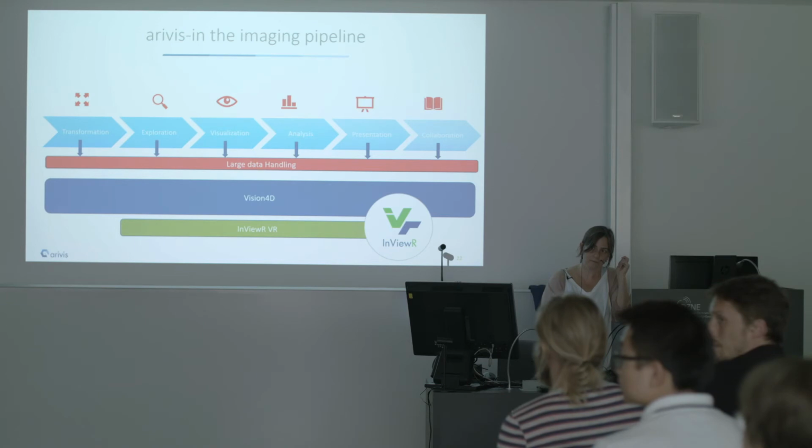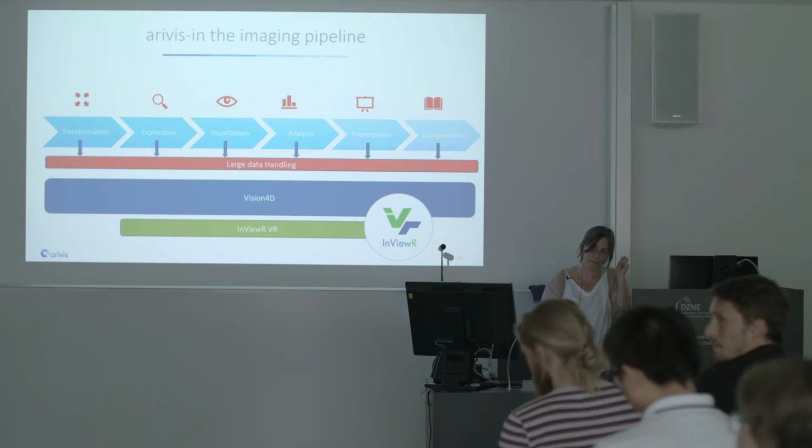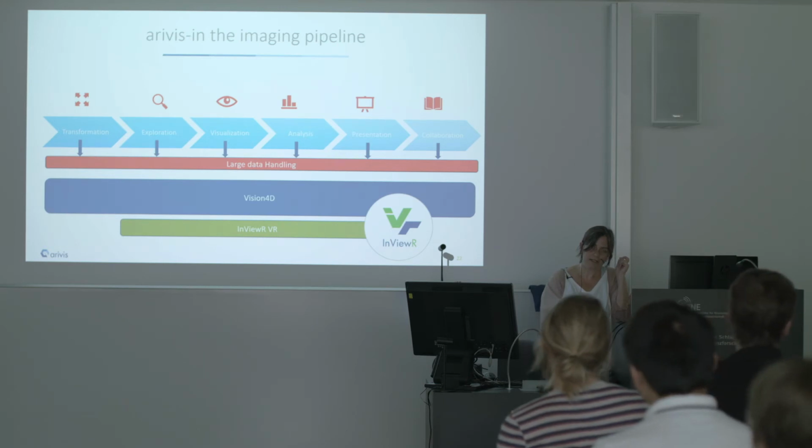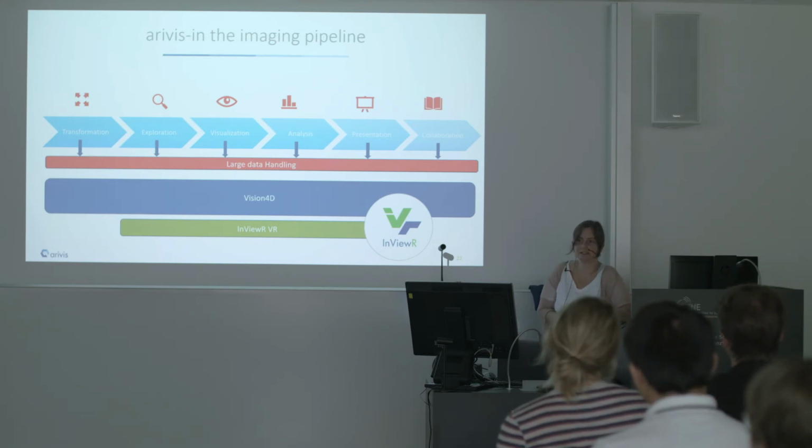I haven't found yet if they try to get a mean pixel. The mean intensity of each pixel, but it is there already. So just how can I extract it?